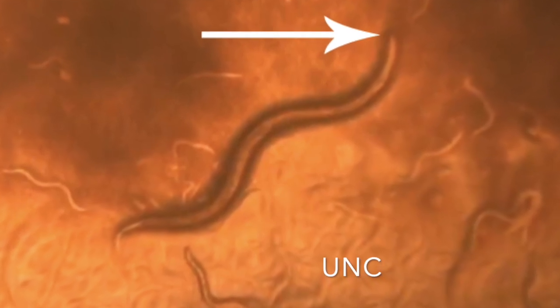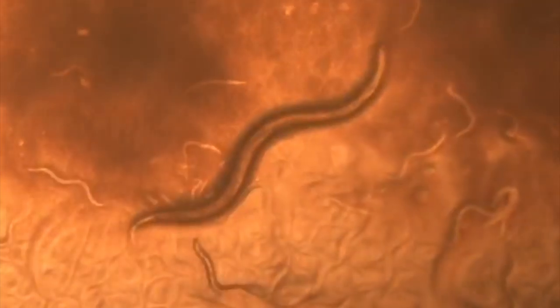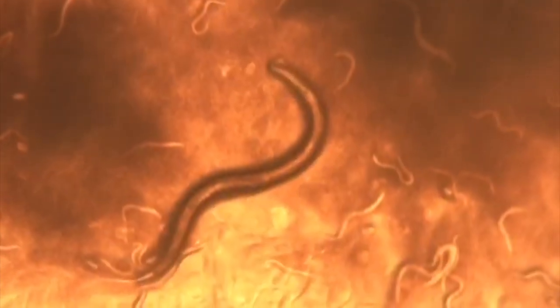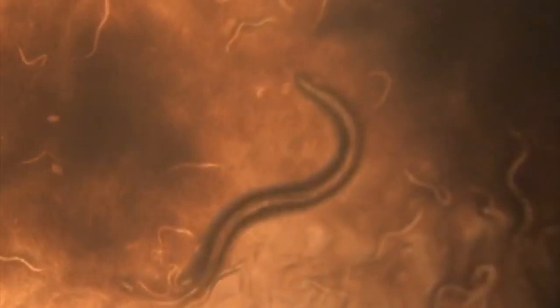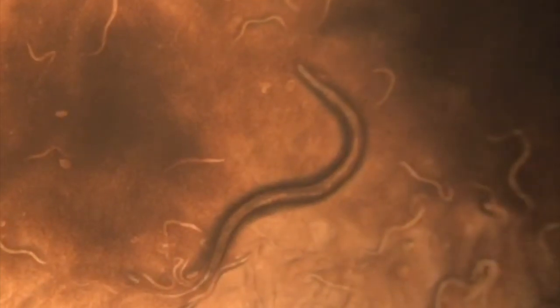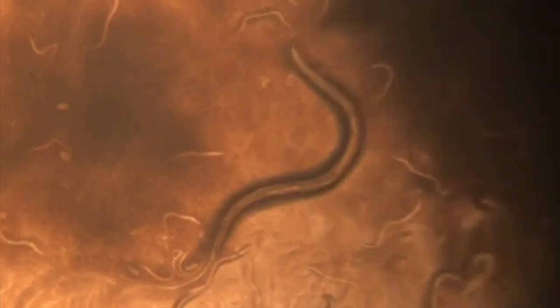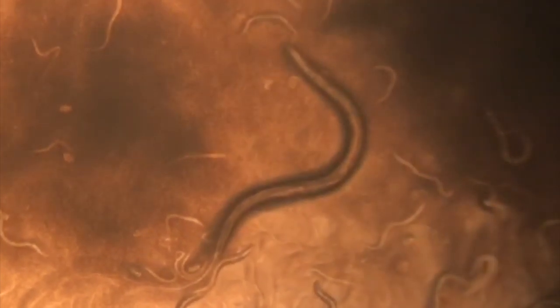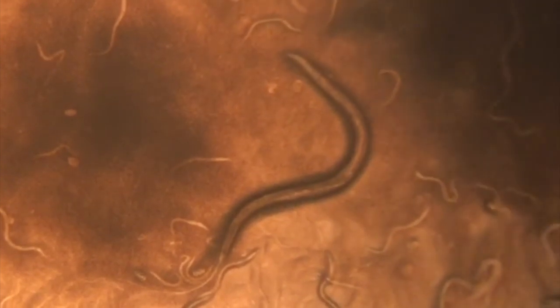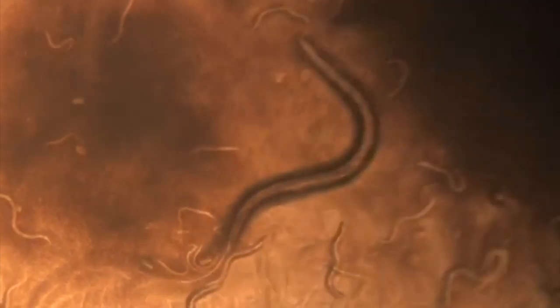Here is the plate of worms affected by the UNC bacteria. The UNC bacteria causes the worms to start violently shaking, and these phenotypes begin to show up around stage L4 and when they're adults. Seizures are usually caused by excessive electrical activity in the brain. If the UNC bacteria causes the worms to have a seizure, then the gene it is affecting must cause the worm to have electrical stability in the brain and keep the worm safe from seizures and violently shaking.